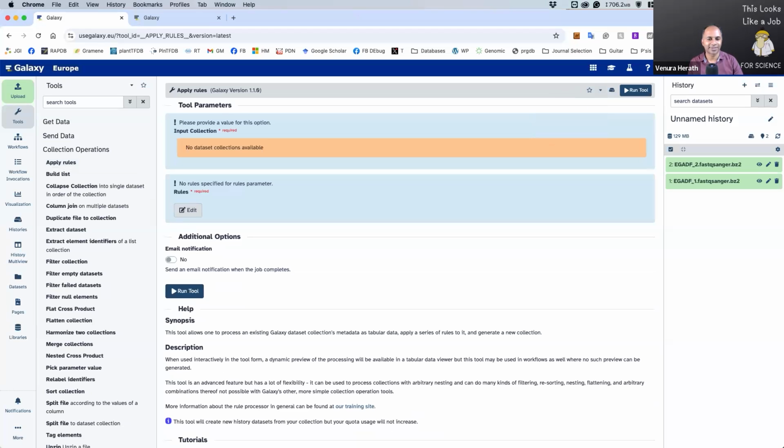Yes, no? Okay, so I'll show you another option.